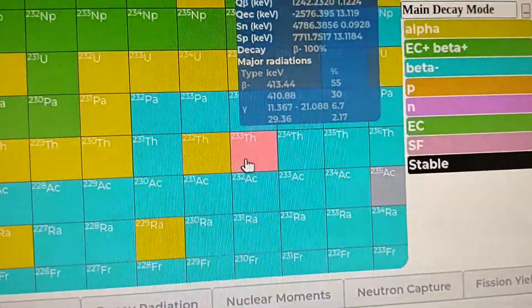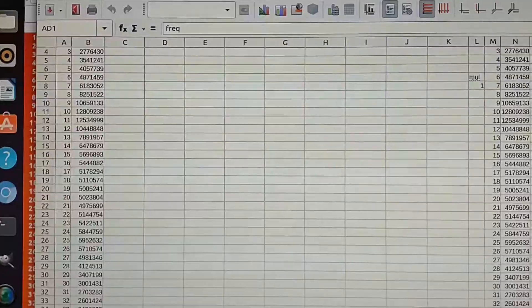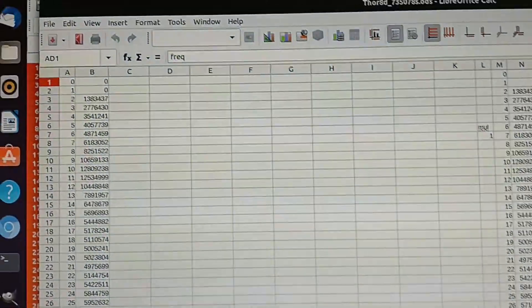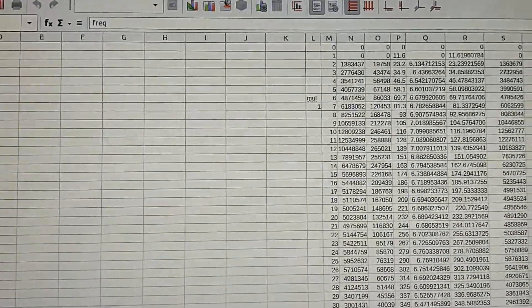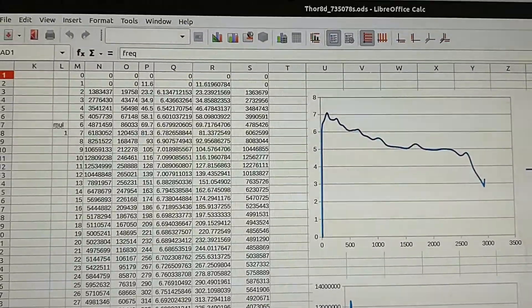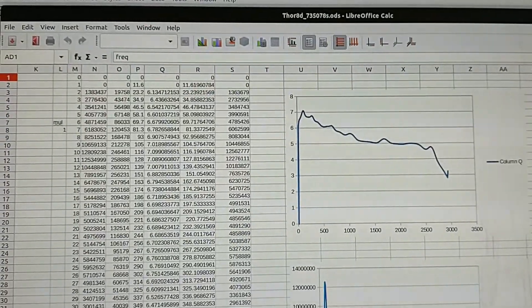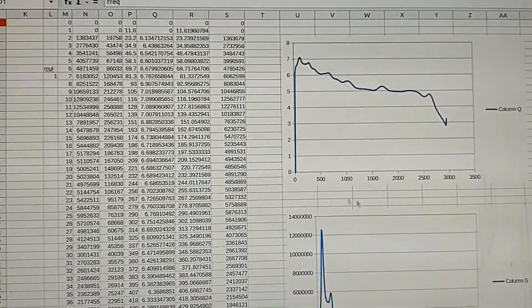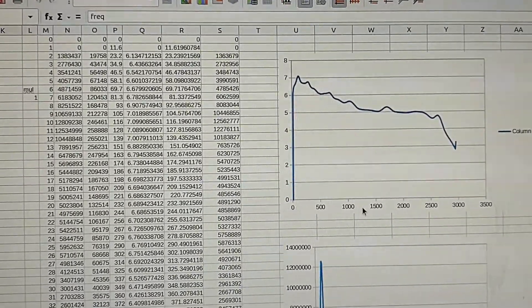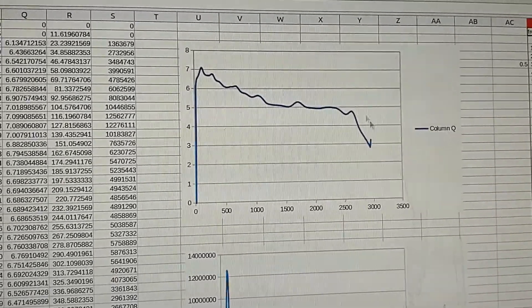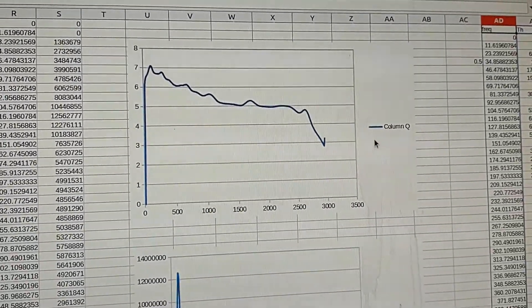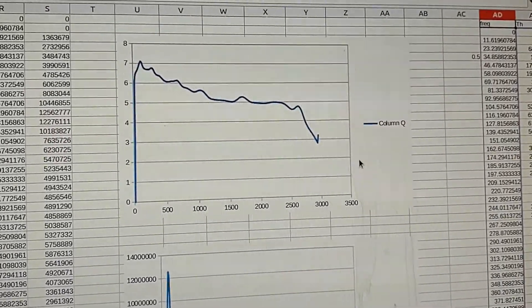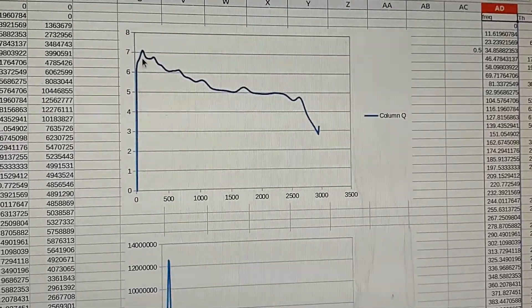So let's take a look at the thorium spectrum that we measured. Again, I imported the thorium spectrums that I have from my gamma ray spectrometer into, not Microsoft because I run Linux, I hate Bill Gates, he's an evil person pushing his evil injections upon people to murder them and pushing his rotten software. ABM, anything but Microsoft. So I use OpenOffice or LibreOffice, I guess it is, and you can actually get that on Windows too, which I encourage you to not use Microsoft products, including the lethal injections, or Bill Gates products.